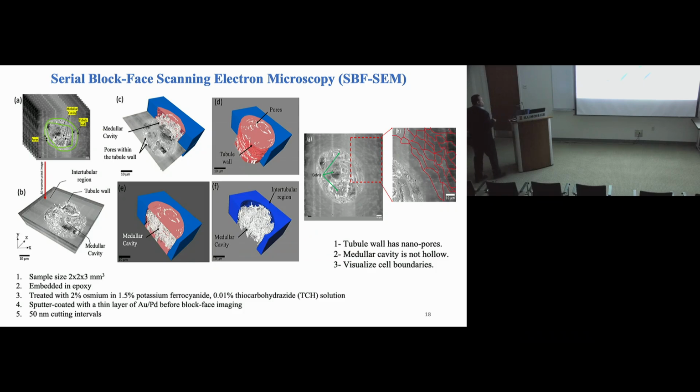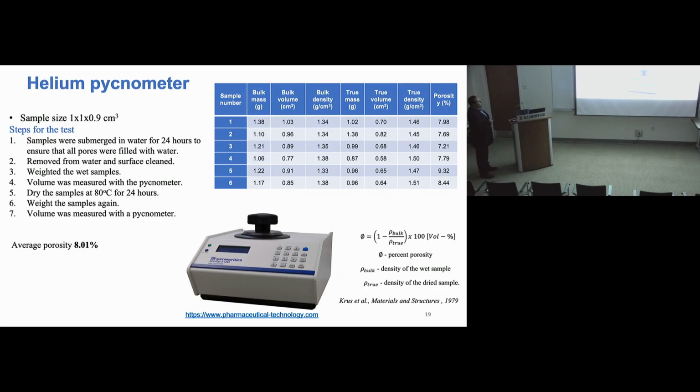So to confirm the finding that there are pores here that were not captured before with a scanning electron microscope or light microscope, we tried to go further, and we used something maybe never used before in biology, I don't know. This instrument, we usually use it in concrete, since my civil engineering background kicked in, and they said, let's try this.